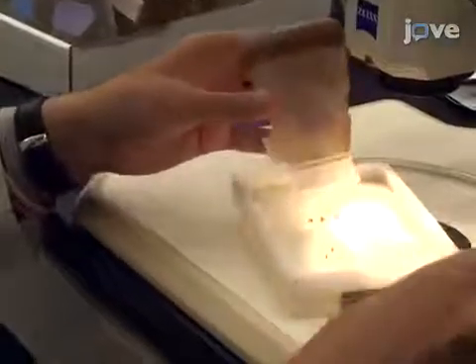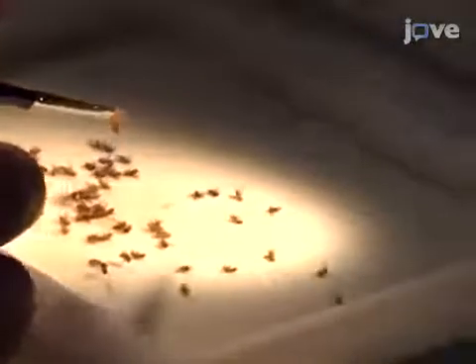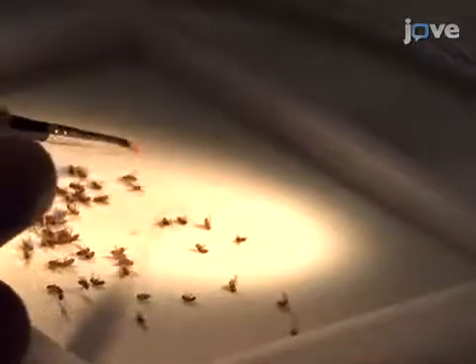Next, set up the second control cross using male flies containing the same FRT site but without a mutation, at a ratio of five females to one male.